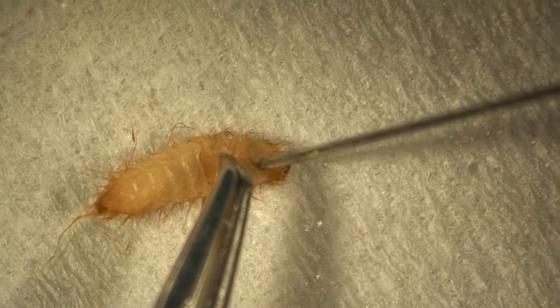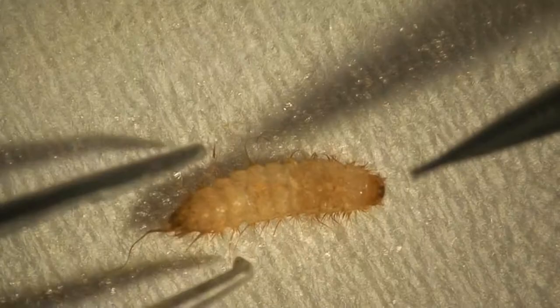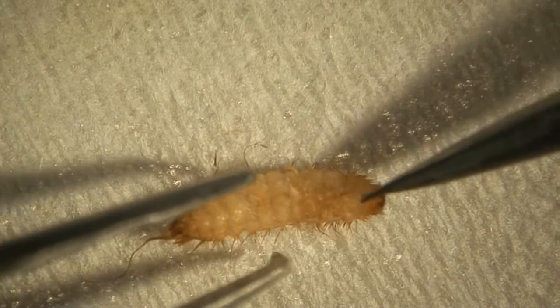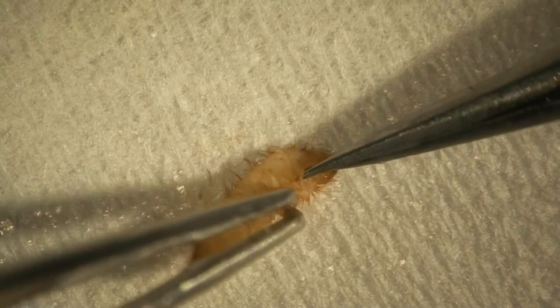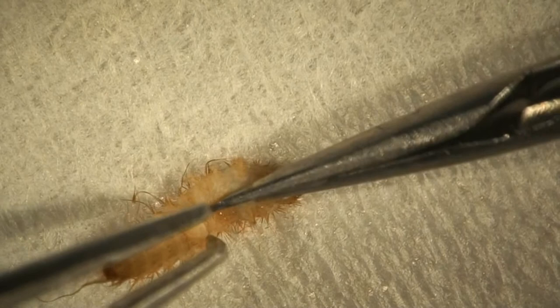A pin is used to pierce the body in the neck region directly underneath the head capsule. This acts as an entry hole for the scissors. A pair of fine-bladed scissors are then carefully inserted into the entry hole, and used to cut through the ventral surface between the thoracic legs and through the midline of the ventrites to the last abdominal segment.